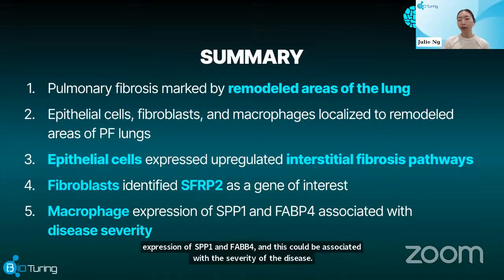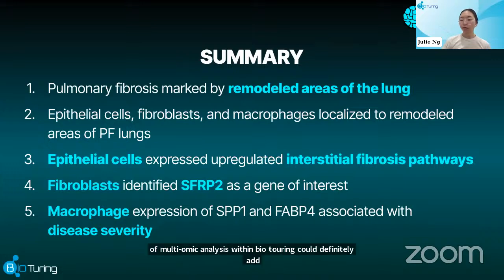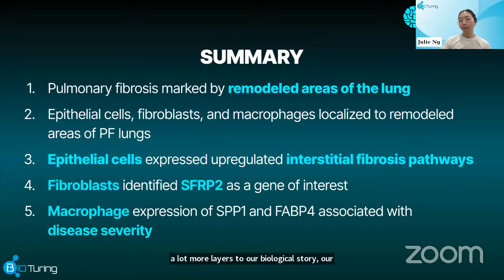And then lastly, at the end, we also demonstrated how this kind of multi-omic analysis within Bioturing could definitely add a lot more layers to our biological story, our biological research question that we're interested in. Yes, multi-omics is very interesting to investigate.